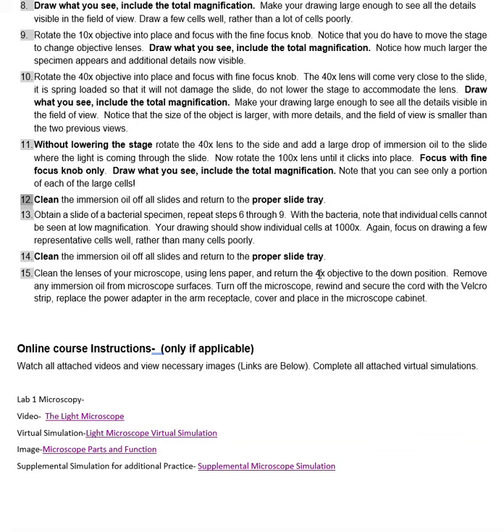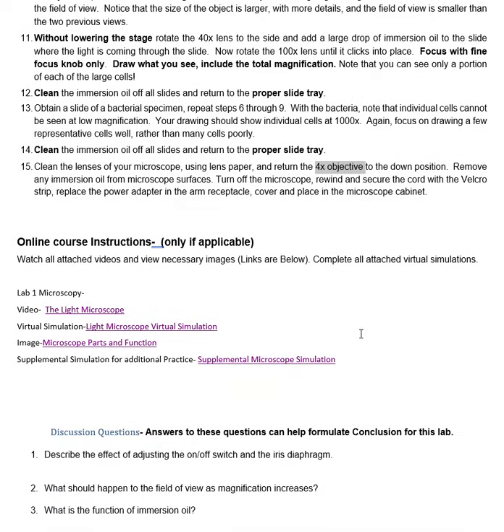When you get ready to store this guy, you guys may have noticed that the 4x is the shortest objective lens and the 100x is the longest, which is why you don't use the coarse adjustment knob. But when you get ready to store it, you want to move the nose piece until the 4x is the one that's down over the stage. Then you're going to take that stage and move it all the way down to the bottom. You unplug, turn the light down, of course. Turn the actual power switch off. Sometimes those are the same thing, depending on the microscope. Then you unplug it, rewind the cord, put it in there, put the cover back on it, and you replace it up. Well, guys, that's everything on Lab 1.